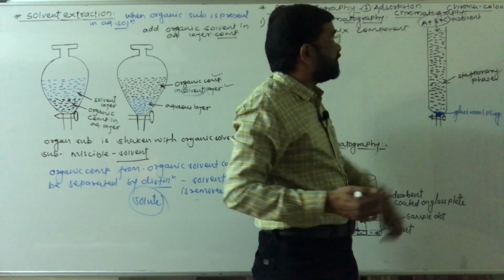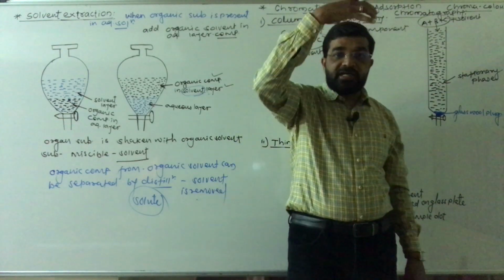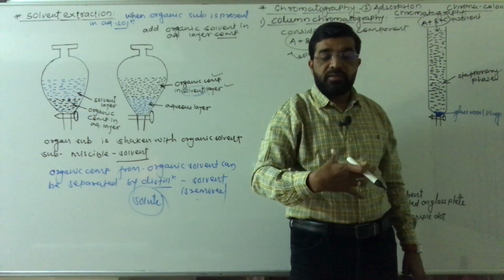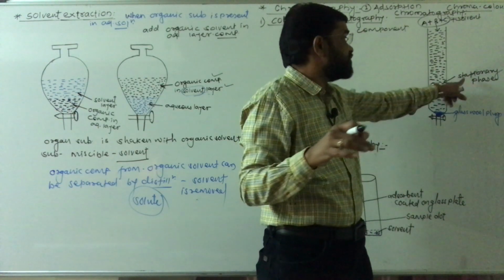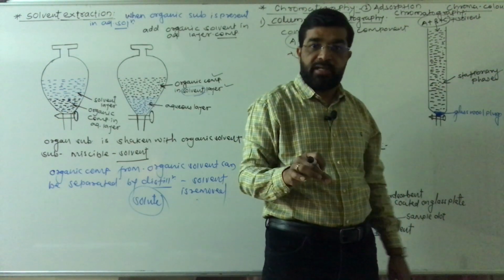When we pour that mixture, the components go down, and while going down they get adsorbed on the stationary phase or adsorbent.